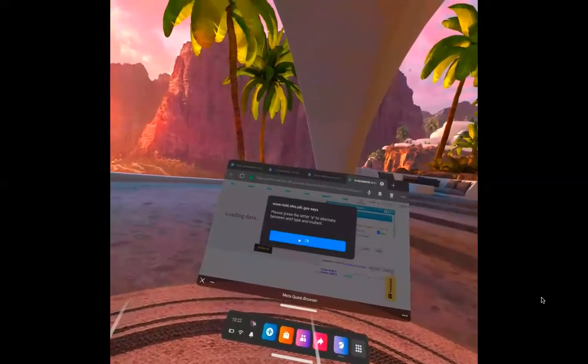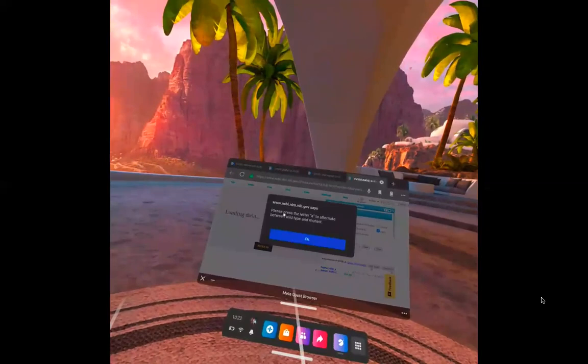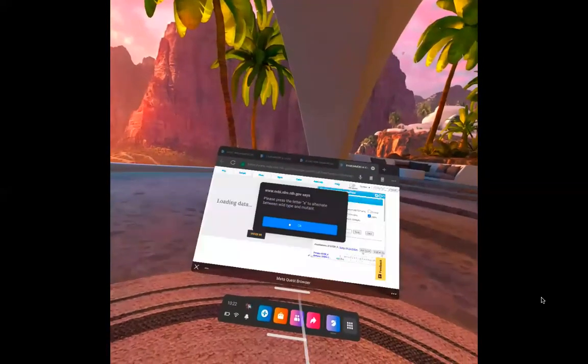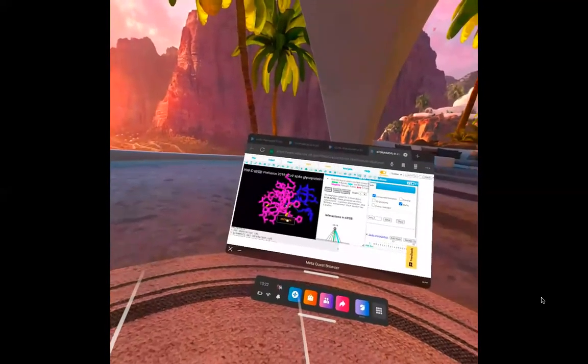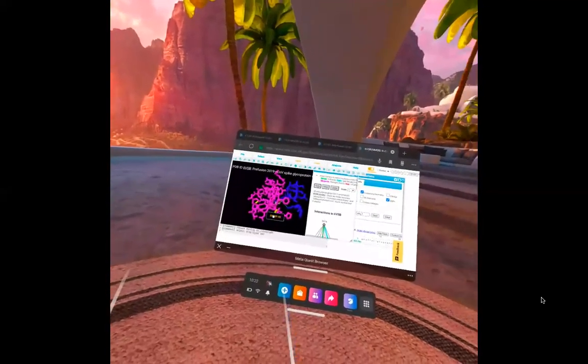Okay, you can alternate in browser, but in VR, we just enter the VR.